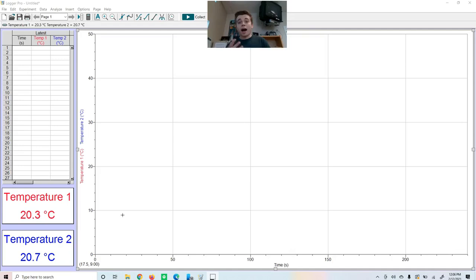Similar to how if you have a high boiling point, we know that you have a strong bond, if we have a large change in temperature, we can either know that we maybe have a strong bond or maybe we have a weak bond. And the purpose of this lab is to determine what a high change in temperature means for bond strength.